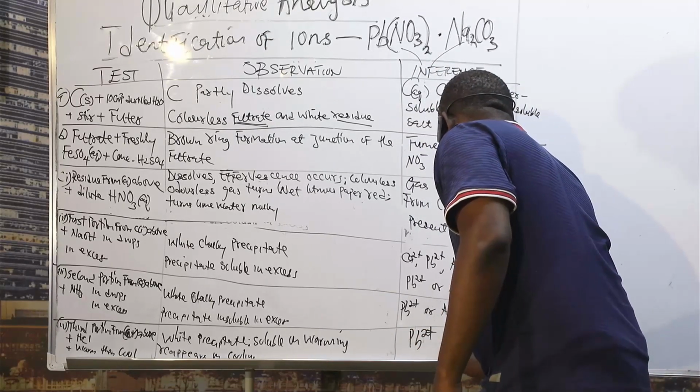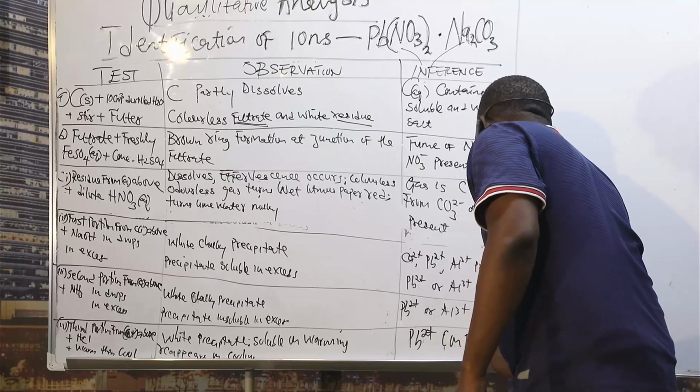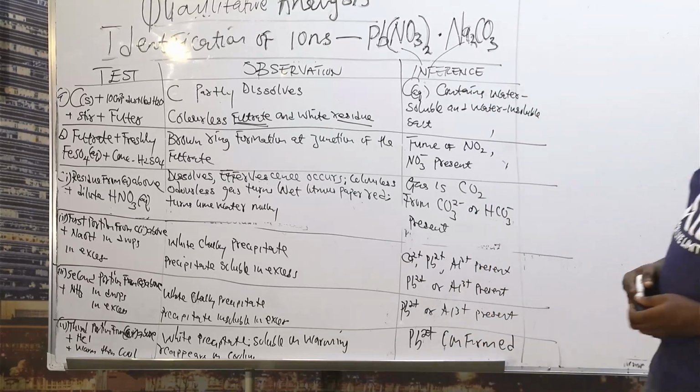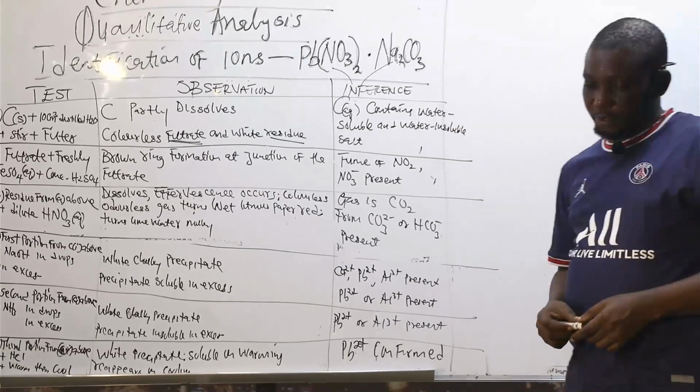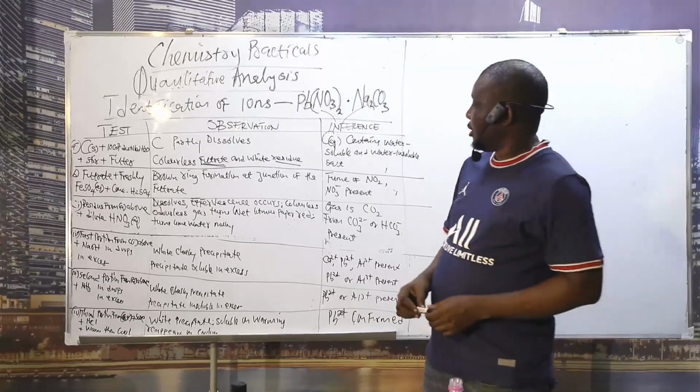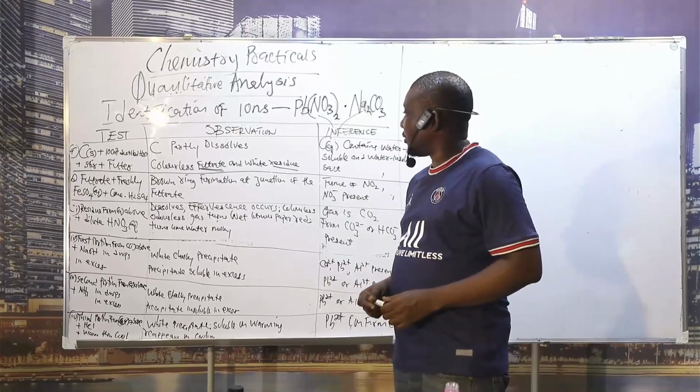Lead 2 ion this time is confirmed. Okay, you can go through the video once again and see how simple it is to carry out this simple test to identify these ions.